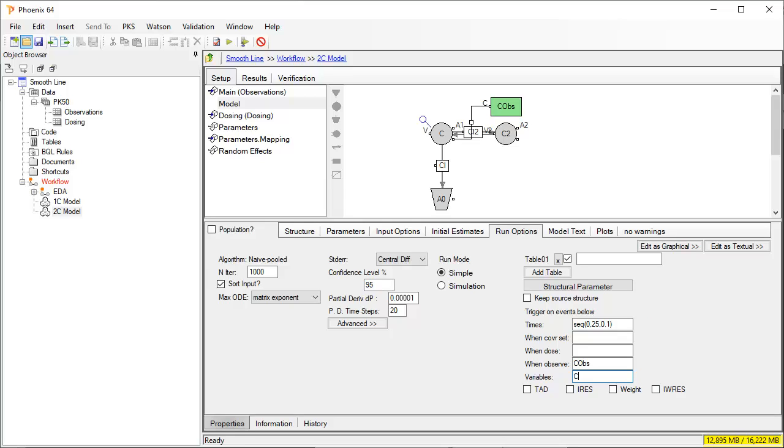If we wanted additional variables like the concentration in the second compartment C2, we would type C comma C2. However, in this example, we only want C.